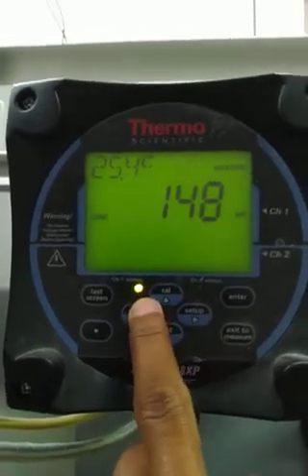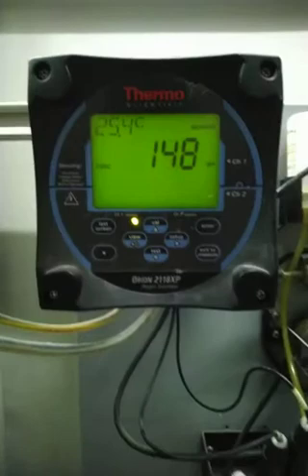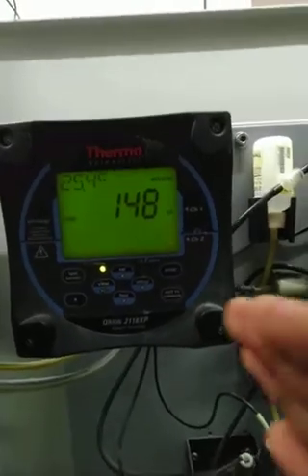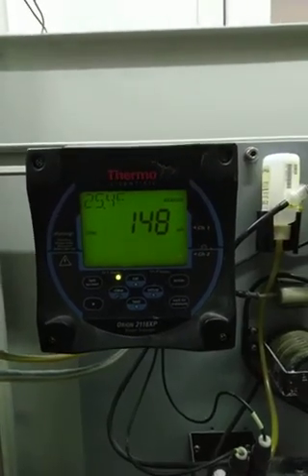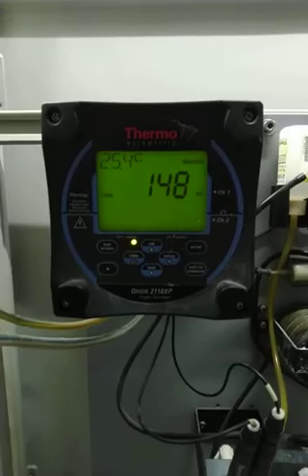This is now green. That means our calibration is complete. So we know in which way the hydrogen analyzer works, and we know how to calibrate it. It's very simple.